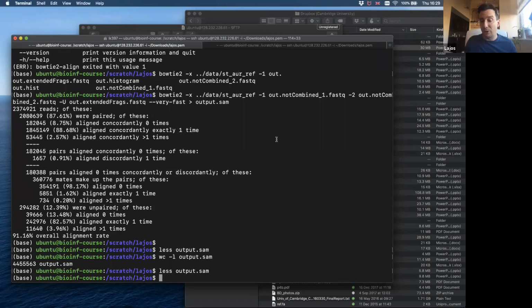If you are doing human whole genome sequencing, this alignment phase can last for days. So you don't want to redo your alignment, which means that you usually want to save your files. And it's often not good to do that with the SAM file, but it's better to do with a BAM file.